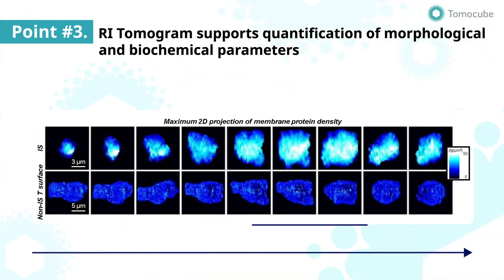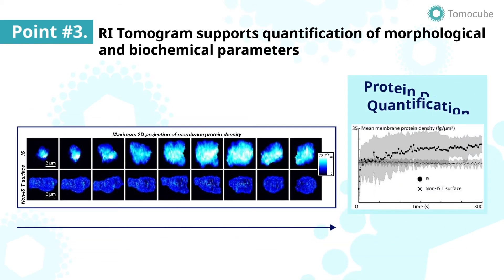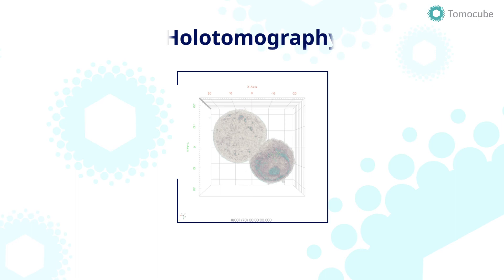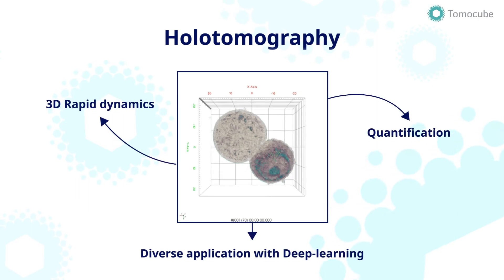Furthermore, protein densities can also be calculated from refractive index values of a membrane surface. When the immunological synapse was formed, a dramatic increase in the membrane protein densities of the synapse area was observed. These results show that holotomography can be used to gain insight into what happens in cells during the immune response.